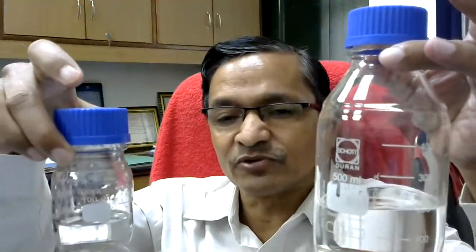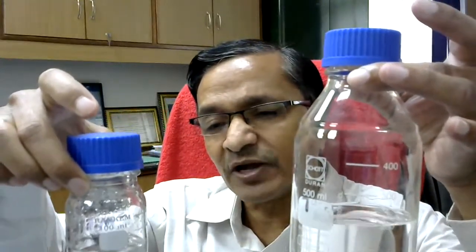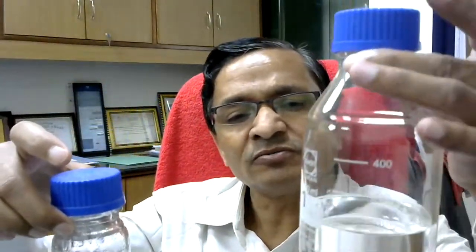This is not a transparent or clear bottle, this is an amber color bottle. You can see this is bigger in size, this is smaller in size, this is a 100 ml bottle, and this is a 500 ml bottle, but both are amber color bottles. Similarly, you can see these are transparent bottles. Those solutions or reagents which are not sensitive to light can be kept in a smaller transparent bottle or bigger bottle depending on the requirement.